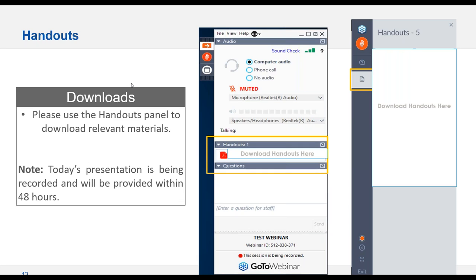There was a question on how the dilution test is done. I remember you had a slide there in the past. I think they're referring to where you did a dilution, and then you're verifying that the result is the same at that dilution, right? Yep.